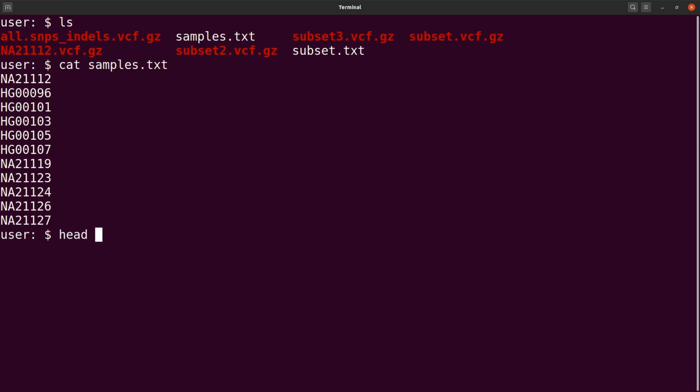So let's say head -n2 samples.txt. Let's put it as exclude.txt. So these are the samples we want excluded. So let's display it here.